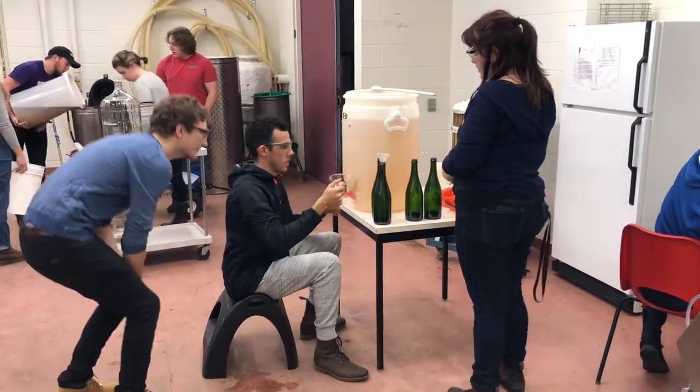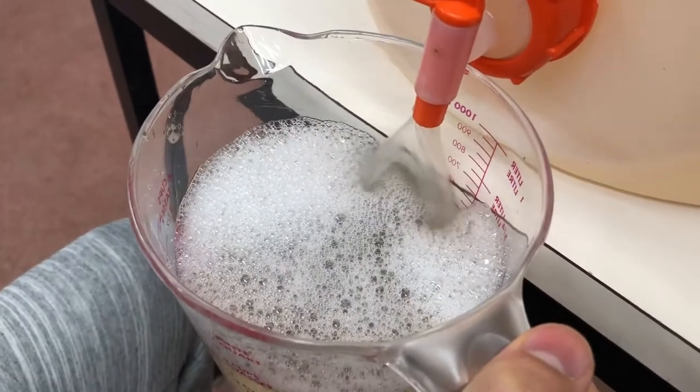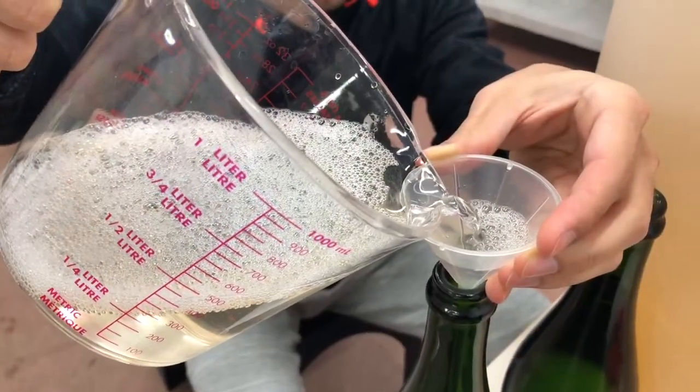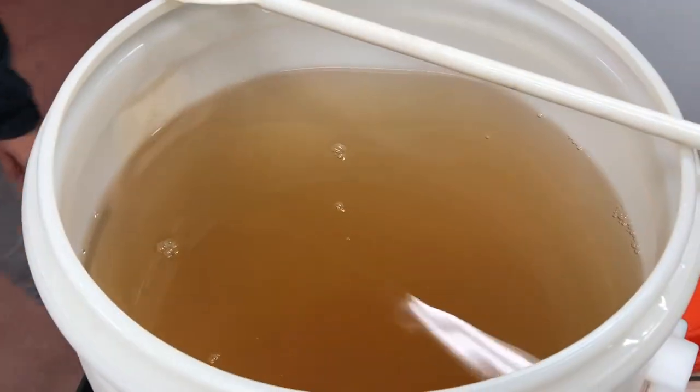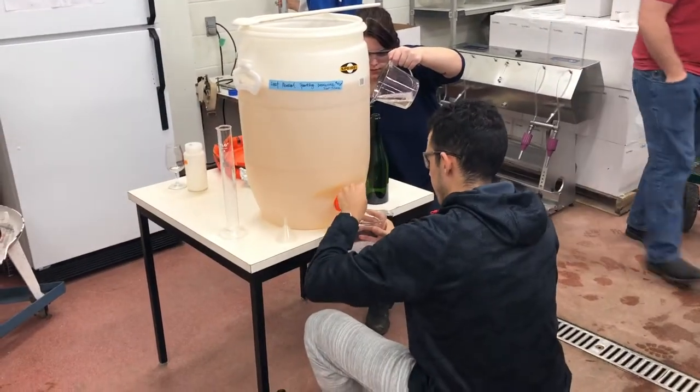For our wine equipment and processing class, we have gotten the chance to make some sparkling wine. We've gotten some pre-made base wine provided from Dr. Belinda Kemp here at Covey, and she's donated the base wine.